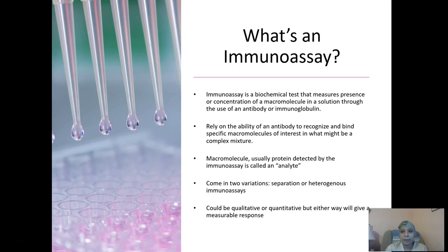An immunoassay is any biochemical test that helps us measure the presence, absence, or concentration of a particular molecule in a solution, using an antibody or an immunoglobulin as our detection method. These are usually specific against the particular antigen that we are interested in. It relies on the ability of that specific antibody to recognize and bind to our macromolecule of interest in however complex a mixture you have. It could be a purified mixture or a very complex mixture, it doesn't matter. It should be able to bind specifically to your molecule and detect it.